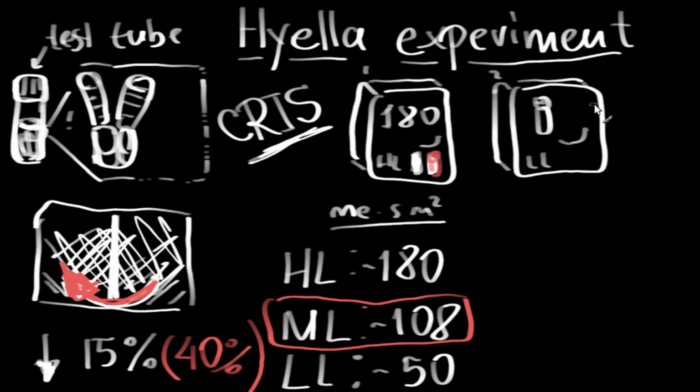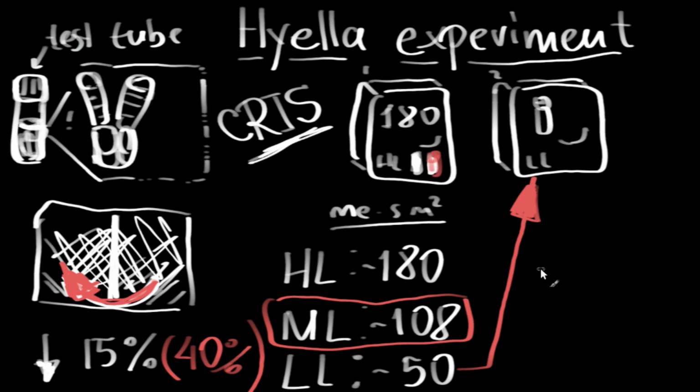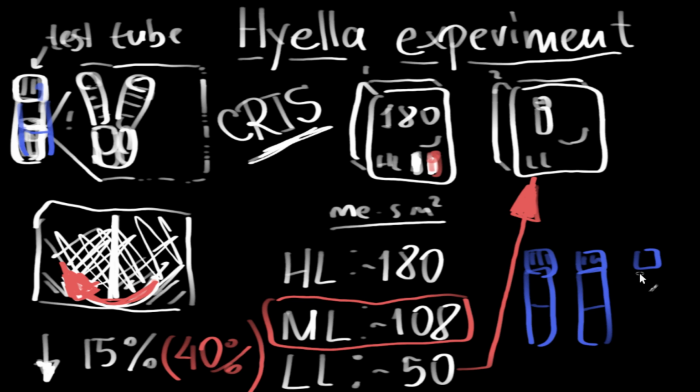And in this one we just measured light intensity, and this appeared to be 15. So to make a summary of what I just said, we had 3 test tubes, and we just transferred biomass from the stock solution from here, and we dispersed it into the 3 tubes.